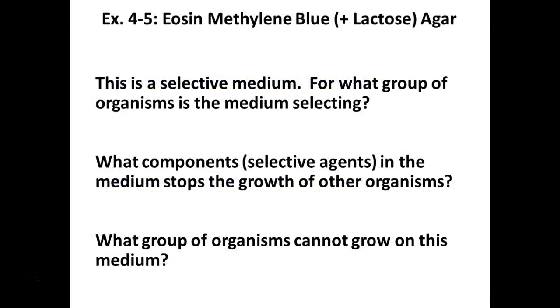Okay, so the last one is eosin methylene blue. There's two different formulas out there, one that contains just lactose and one that contains sucrose and lactose. We use the formula that just contains lactose, right? So our EMB plates only contain lactose, they do not contain sucrose.